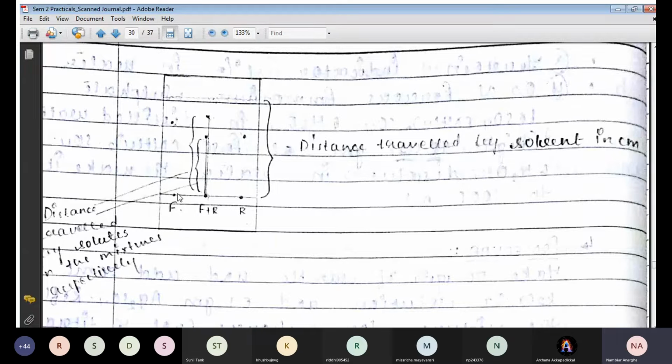Right? Now this fluorescent spot that we have made, after the run it may have gone up. It shows some run, okay? So it goes up. Now after, I am talking to you in very layman language, okay? I'm not even using the technical terms. So I hope you're actually following me, what I'm trying to say.